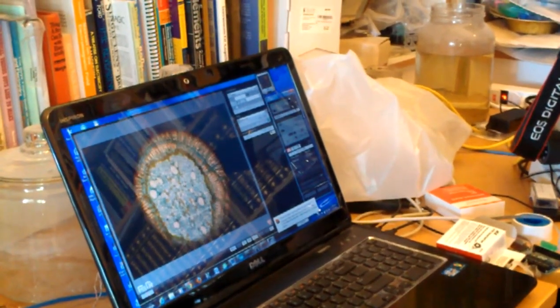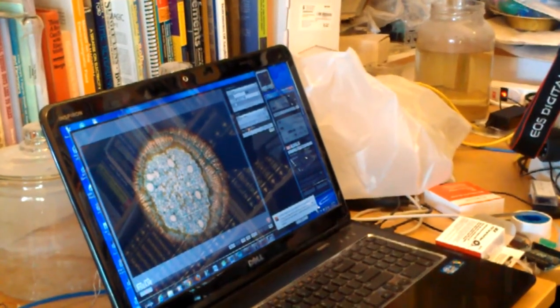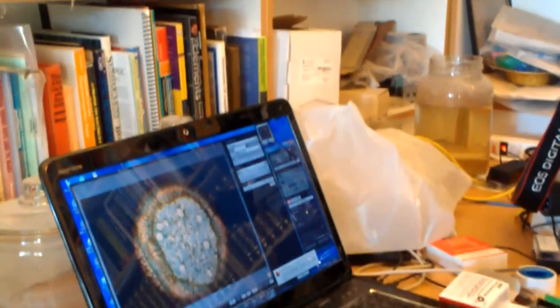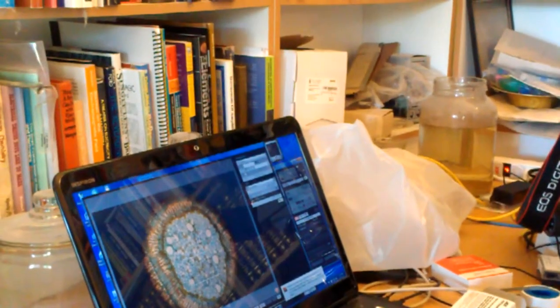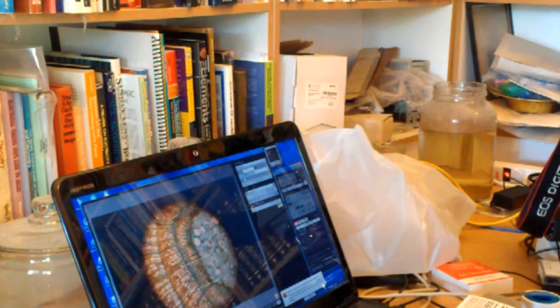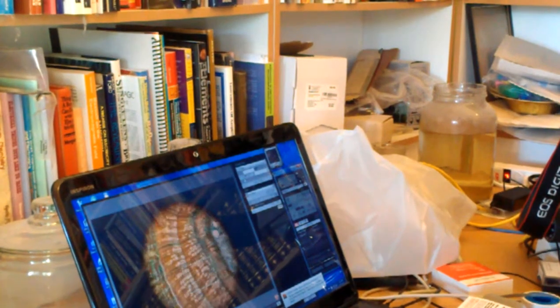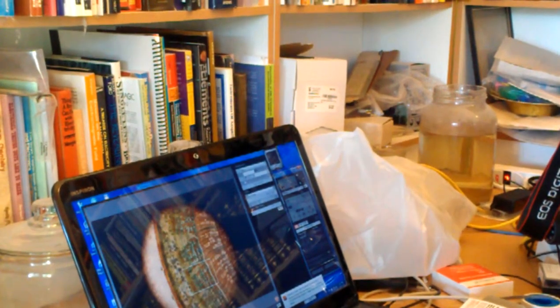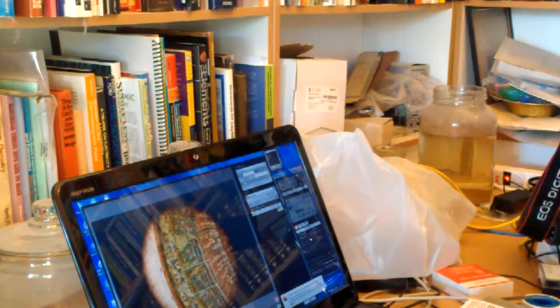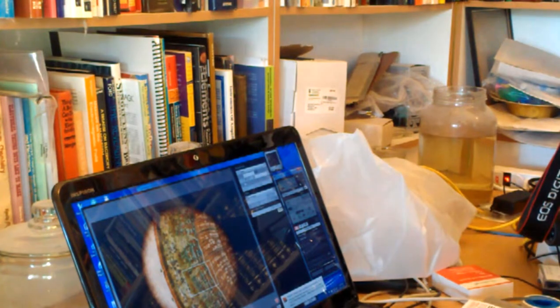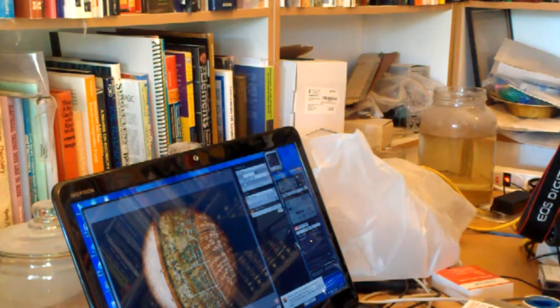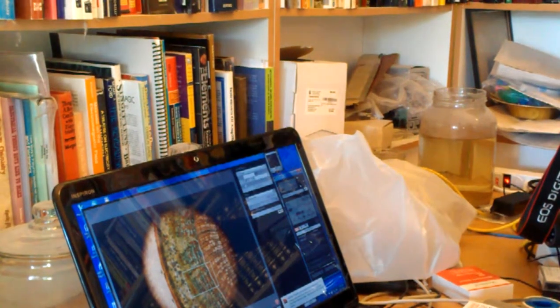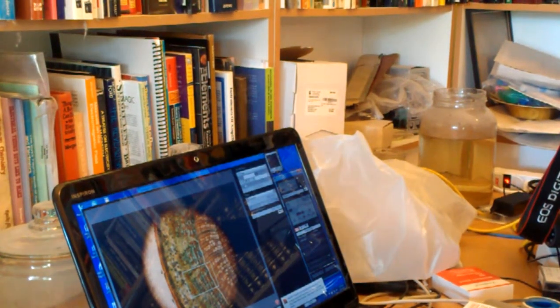You see that we're also zoomed in a little more, so we don't have the nice wide field of view that we had with the cell phone, which means that we would have to move it around a bit in order to see all of what we were seeing before.